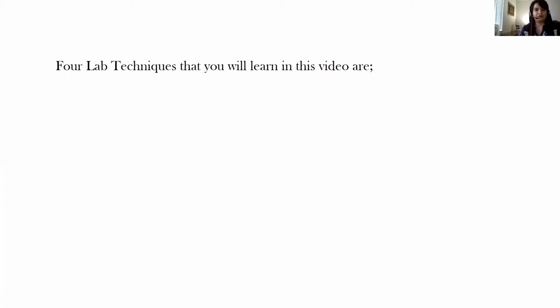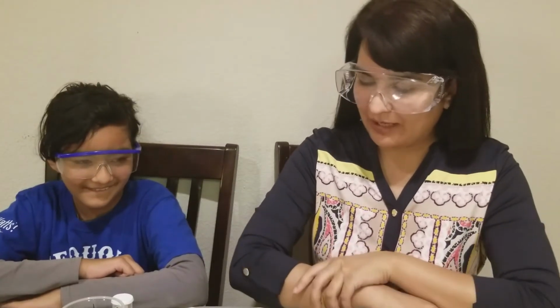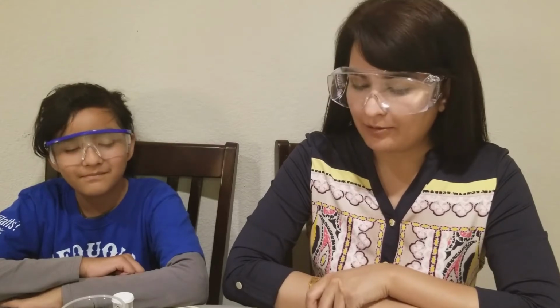Okay, so the 4 lab techniques that you will learn in this video begin with weighing by difference. And here is the video for weighing by difference. Okay, so in this video, I'm going to show you how to perform weighing by difference. Many times in chemistry, the weighings that we perform are weighing by difference.